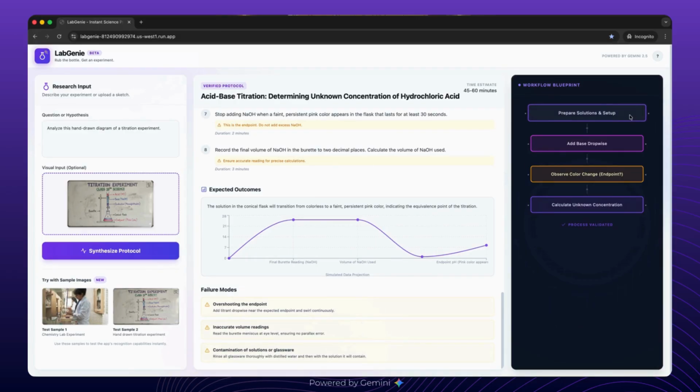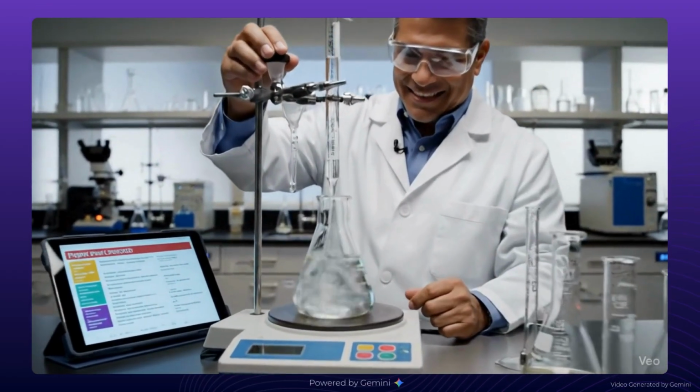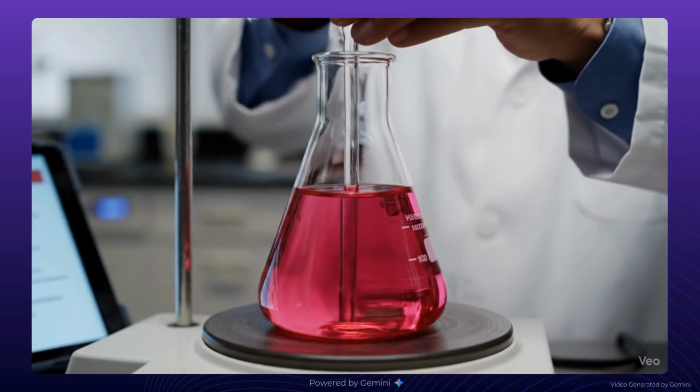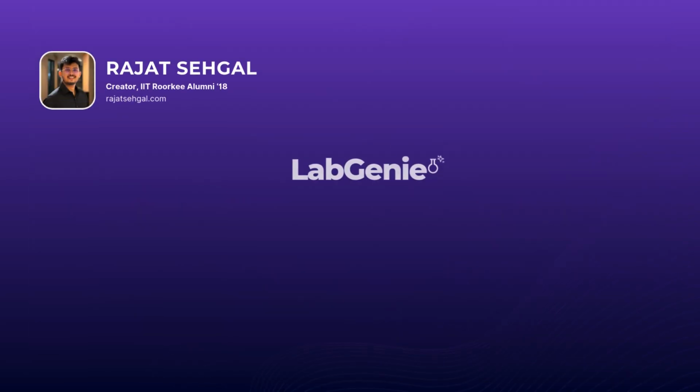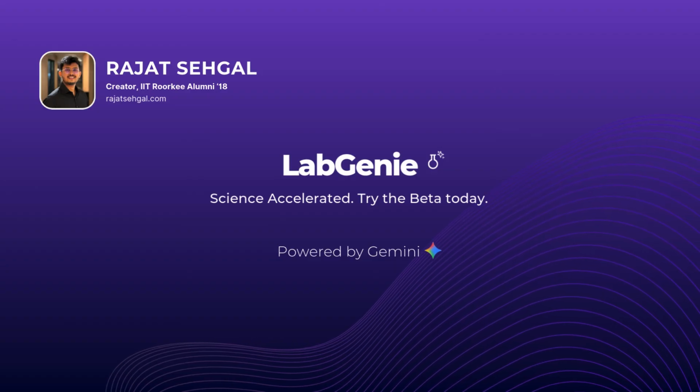This is why LabGenie goes viral. We've replaced days of planning with minutes of prep. You go straight to the bench, confidently perform the experiment, and finally determine that unknown concentration, knowing your results are backed by AI-verified data. Stop analyzing diagrams in a notebook.